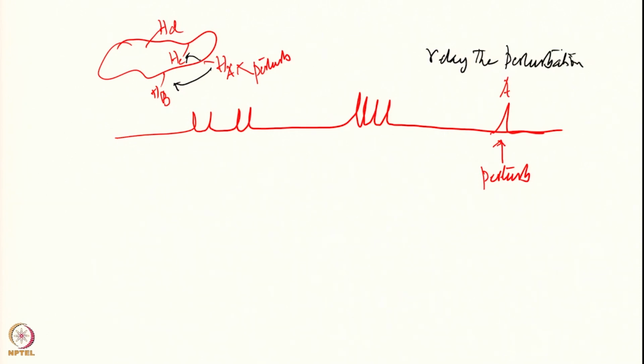And for this what is required? There has to be coupling, and that is the dipolar coupling. All the protons are magnetic dipoles, therefore there is a magnetic dipolar coupling. So when I perturb one of those, suppose I have the energy levels for the spin A and these are the populations, N1 here and N2 there. When I perturb it, it means I change these populations.